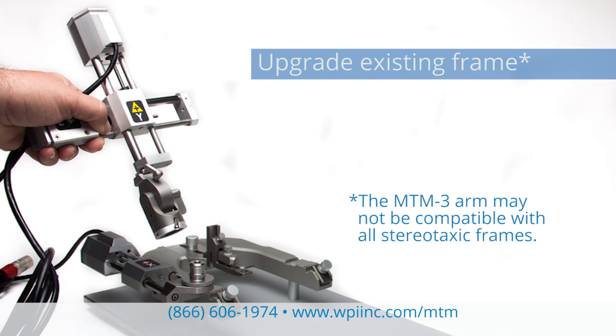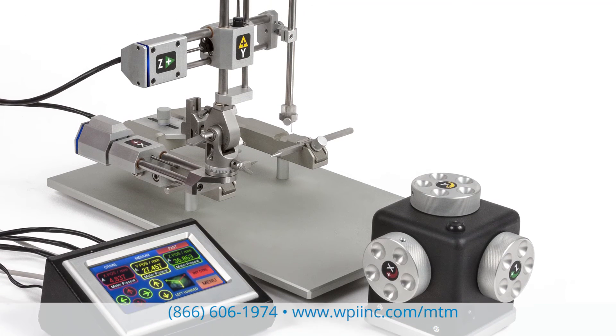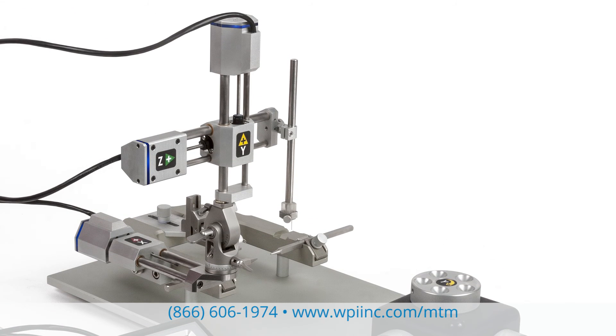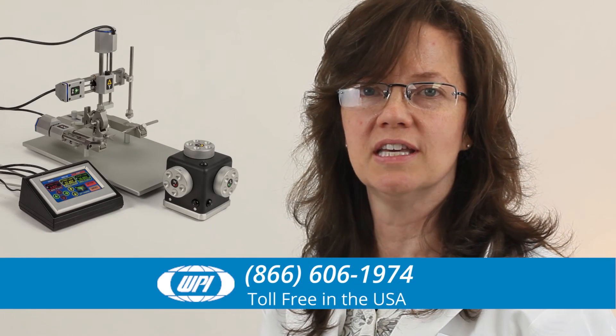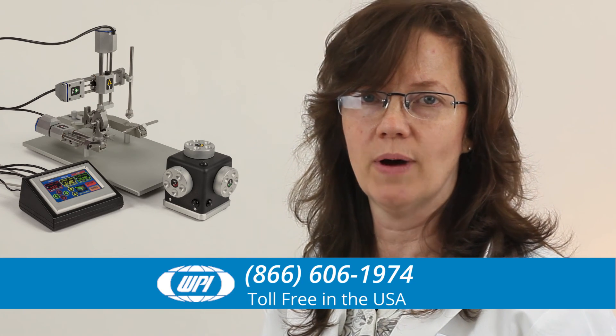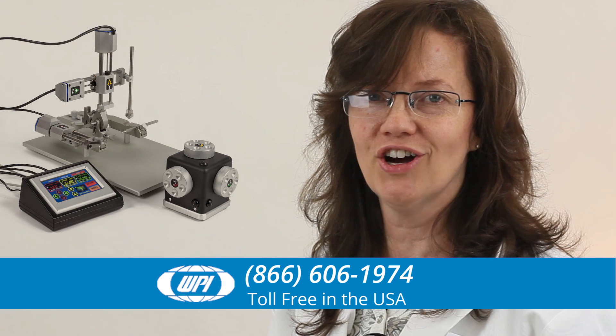The MTM arm may be added to your existing frame. You can count on the MTM3 for precise, repeatable movements time after time. The MTM3 puts the ultimate control in your hands. If you have any questions, just give us a call.